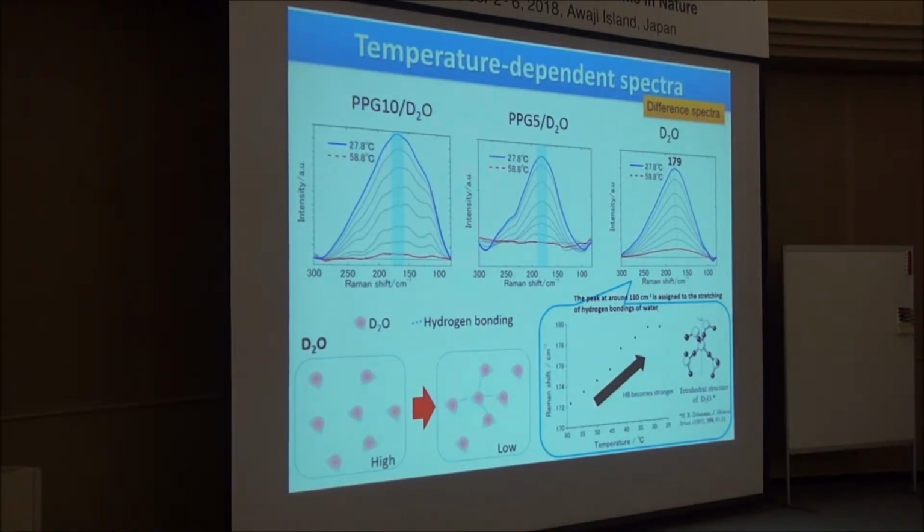Around 170 to 180 wave number, there is a peak in all the systems.